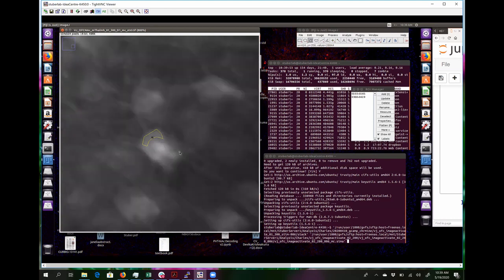I guess another thing you could do, and maybe you do this, is stepping away from the standard deviation projection and just looking at the video, and seeing the certain frames where the smaller ROI is active but not the one that you just drew, to get a better sense of where the cell above is.